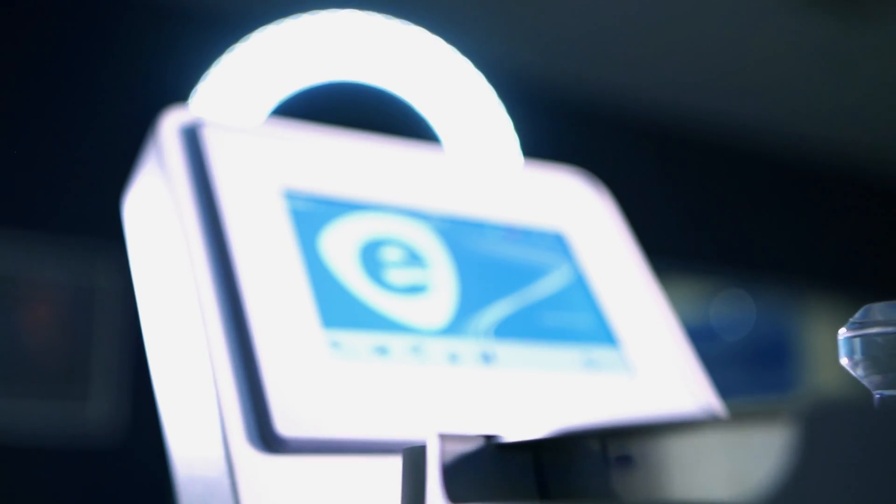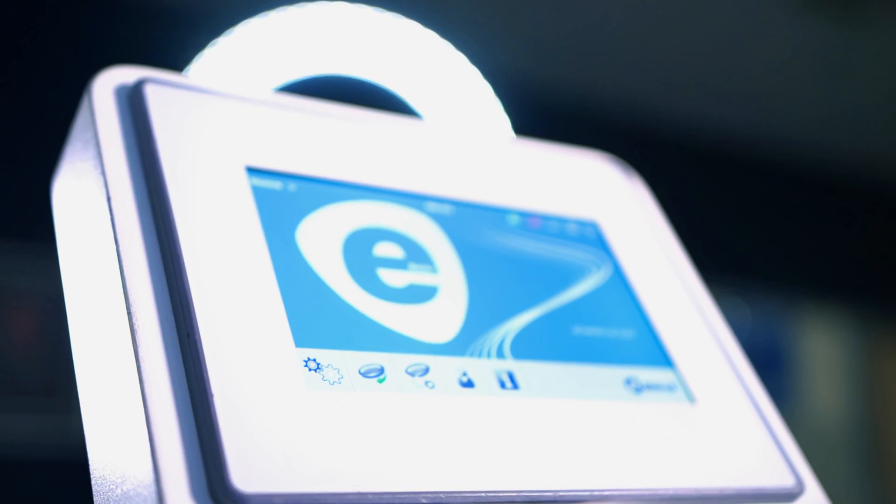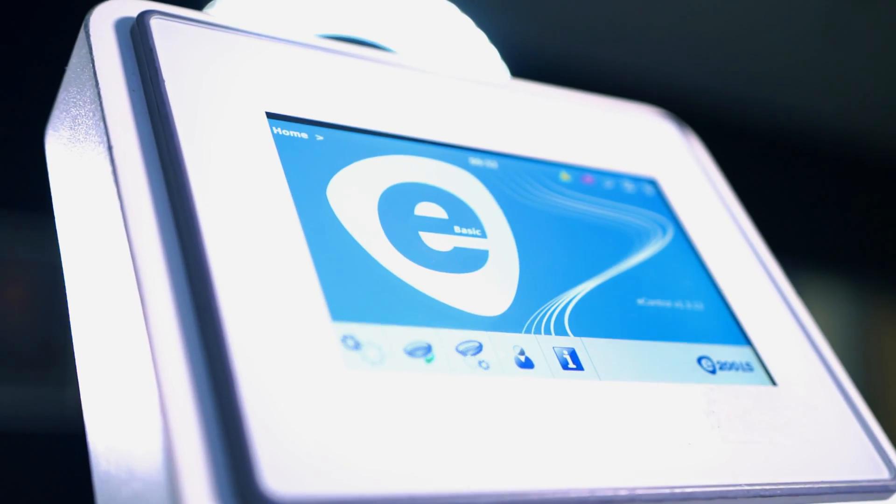The E200LS utilizes specialized software to operate. There are four levels of software to choose from, with each new level offering more features than the last. The level of software you choose will change the cost of the Alpine unit. The light software is $9,000, the basic software version is $11,000, the ultimate software is $14,000, and the security software is $19,000. Any test sieves you may need will also affect the cost of your Alpine.